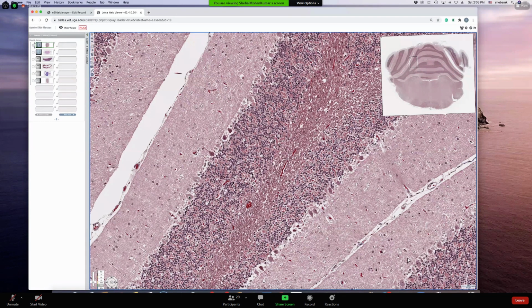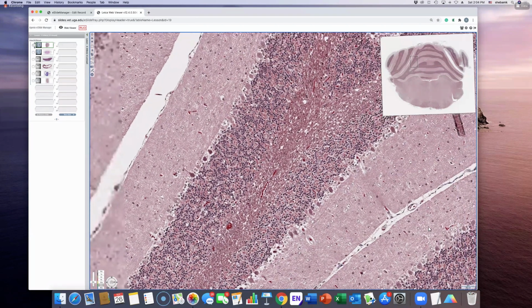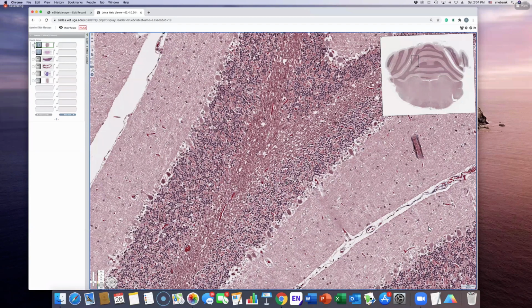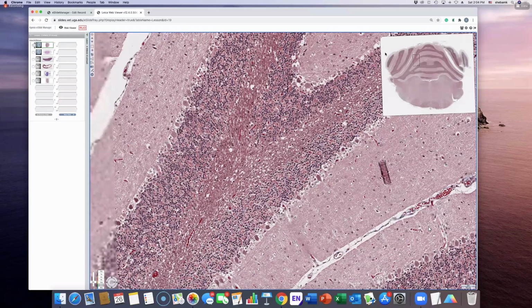Piriform neurons, or Purkinje cells, whatever you want to call them. And these are the smallest neurons in the body, granule cell neurons, present only in the cerebellum. You see the axons running on the inside. There are also some membranes covering the brain that you have to know.